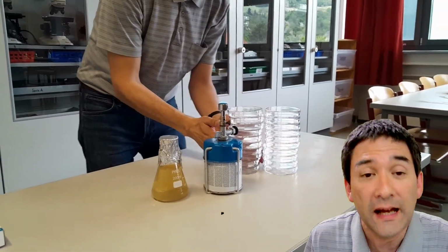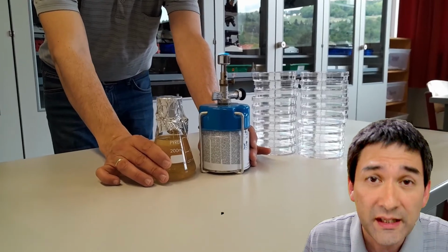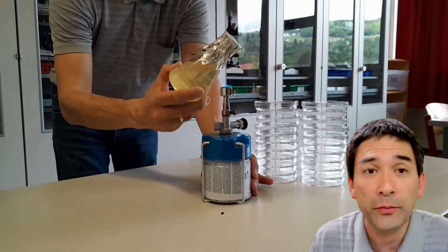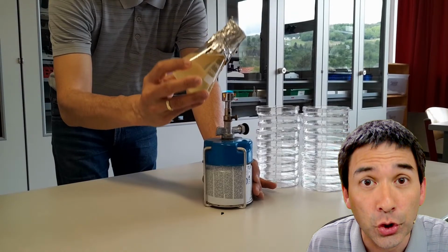Next to it in the flask, you can see the culture medium that I prepared, which contains the agar and also yeast extract. It's covered with aluminum foil, and the whole thing has been autoclaved. This means I put it into a pressure cooker.